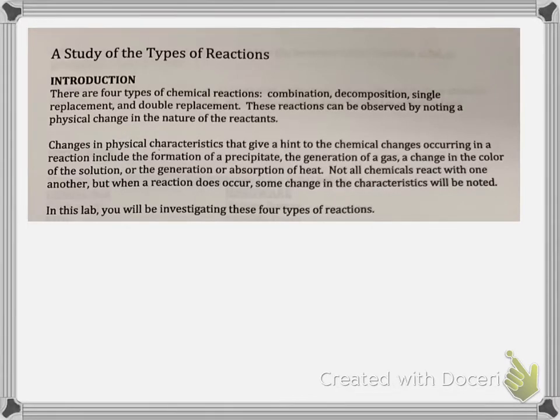This is the lab video that goes with the chemical reactions lab. A completed lab will include the pre-lab, recording of the observations shown in this video, and then balancing the chemical equations for the reactions that are demonstrated. There are no post-lab questions in this lab. The balancing of the equations counts for the post-lab questions.